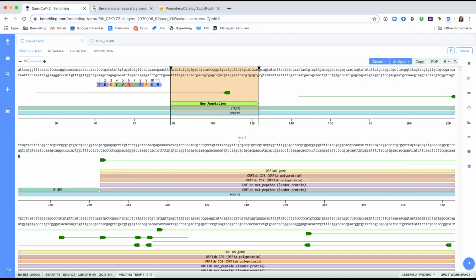Now that we've talked through the basics of our molecular biology tool, we are now going to walk through the top voted topic from last time, which was how to design constructs within Benchling. To demonstrate how to do this with you all, I'm going to be taking one of the genes from the SARS-CoV-2 genome and Gibson cloning that into a plasmid, pET-31b, along with fusing that SARS-CoV-2 gene with a GFP gene. This may be a similar experiment to what you were planning with your iGEM projects, or maybe you might be using the COVID genome as well for your projects.